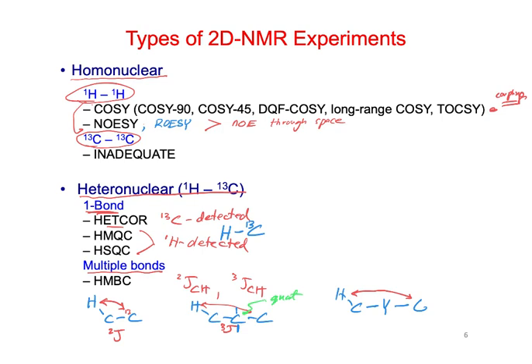In the multiple bond experiment, can we have another heteroatom attached to hydrogen or not? Whether this is a heteroatom here, possibly, but if this is an OH, we often don't see coupling to that because we have exchange, and even NHs, sometimes it depends. If those easily exchange, even like an amine, it doesn't typically show much of this coupling. If we have an amide, though, that doesn't exchange as easily, sometimes we can see that kind of coupling.